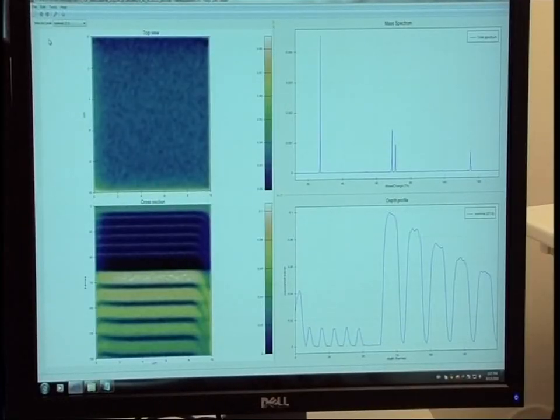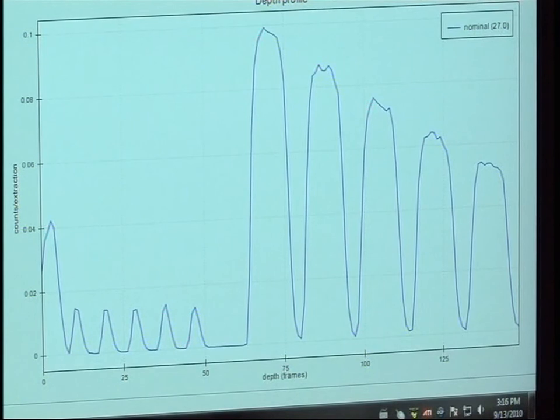Here is the second example, where there are several layers of material on a substrate. And on the right, we can see the cross-section for the indium element, and its amount is changing in the individual layers as we are progressing in depth.